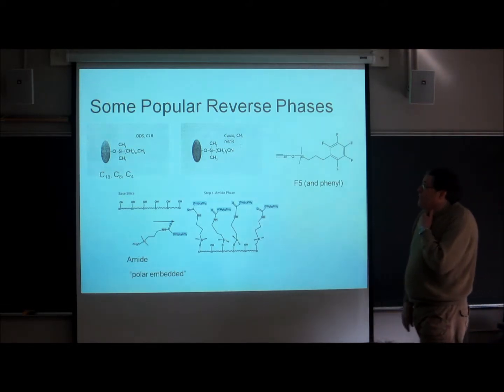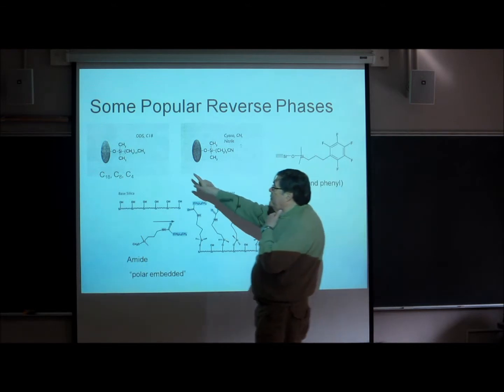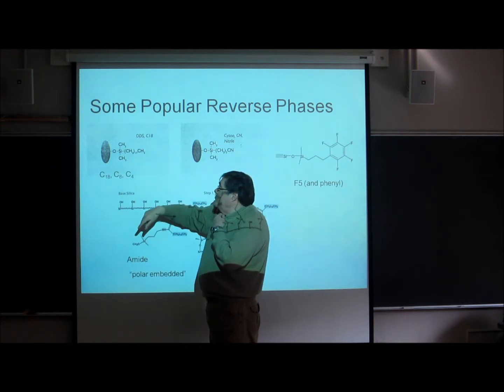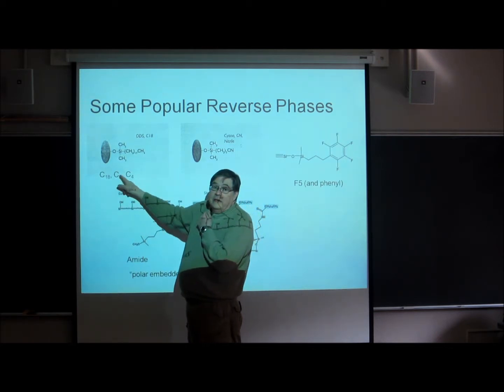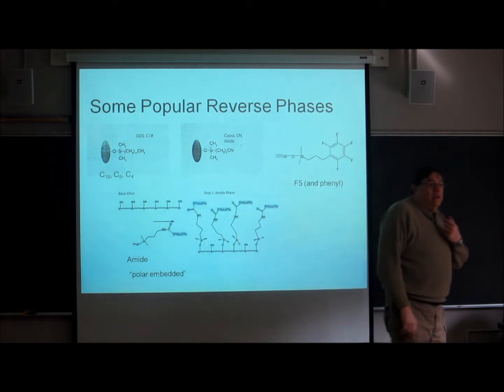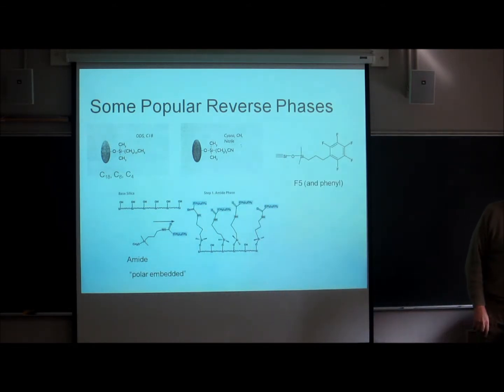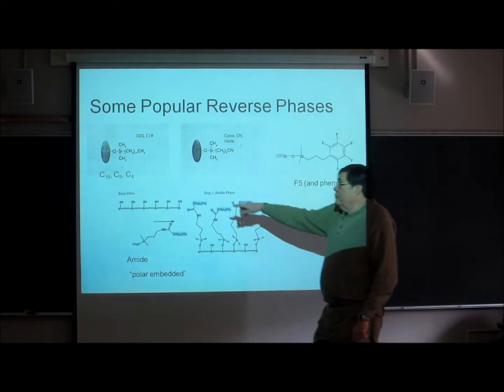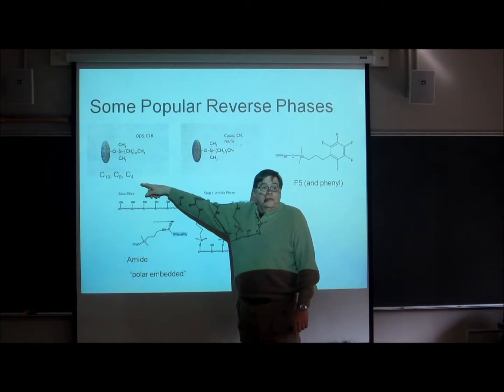Okay. Here's the classic, most popular octadecyl silane, C18, and also available in C8 and C4. Now, if you were to just make a guess about the oiliness of these reverse phases, which would be the most oily and which would be the least oily of this group of possibilities?